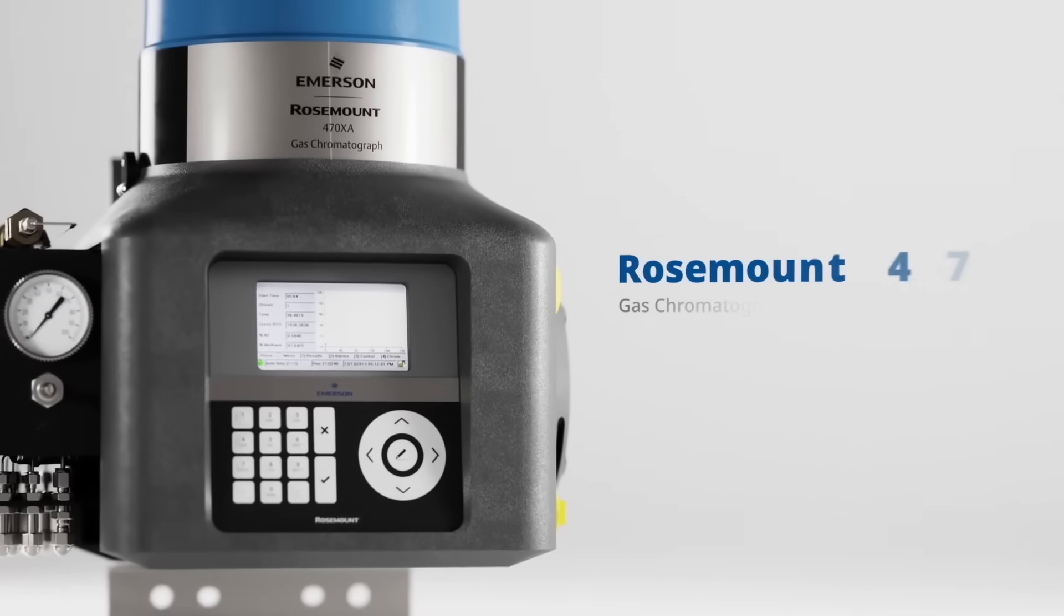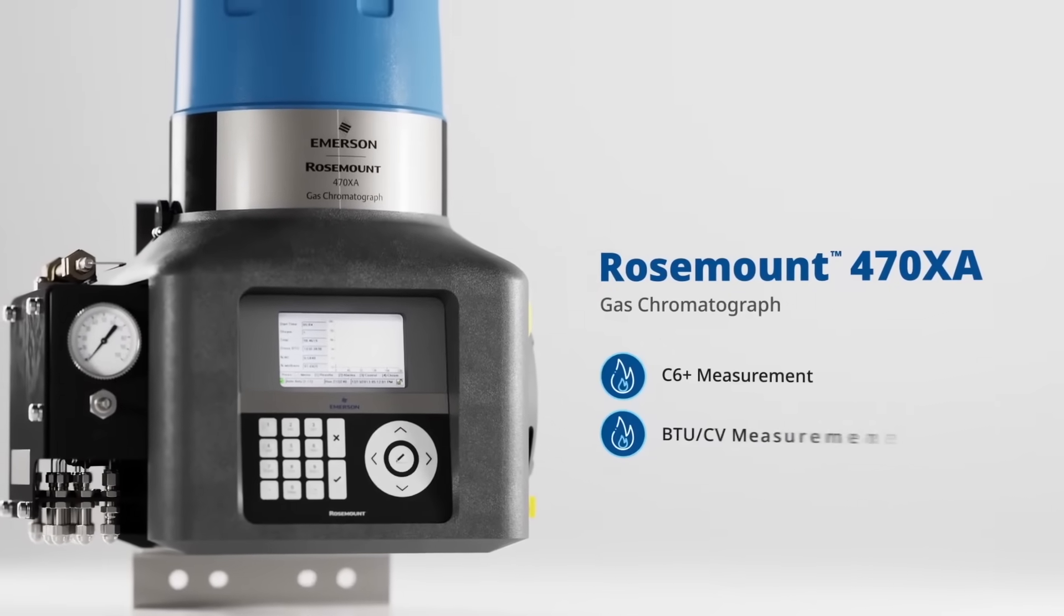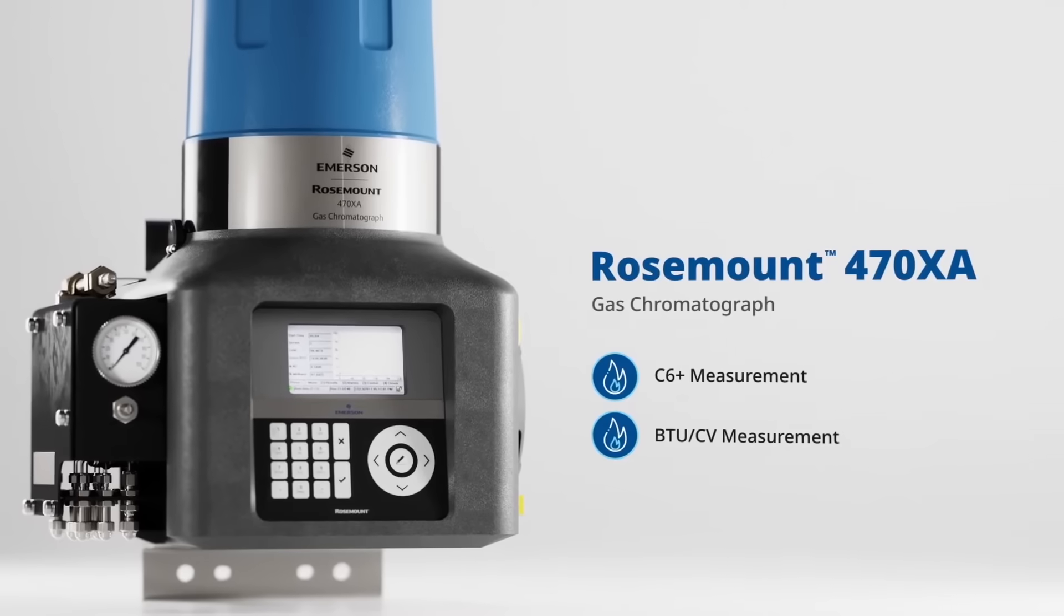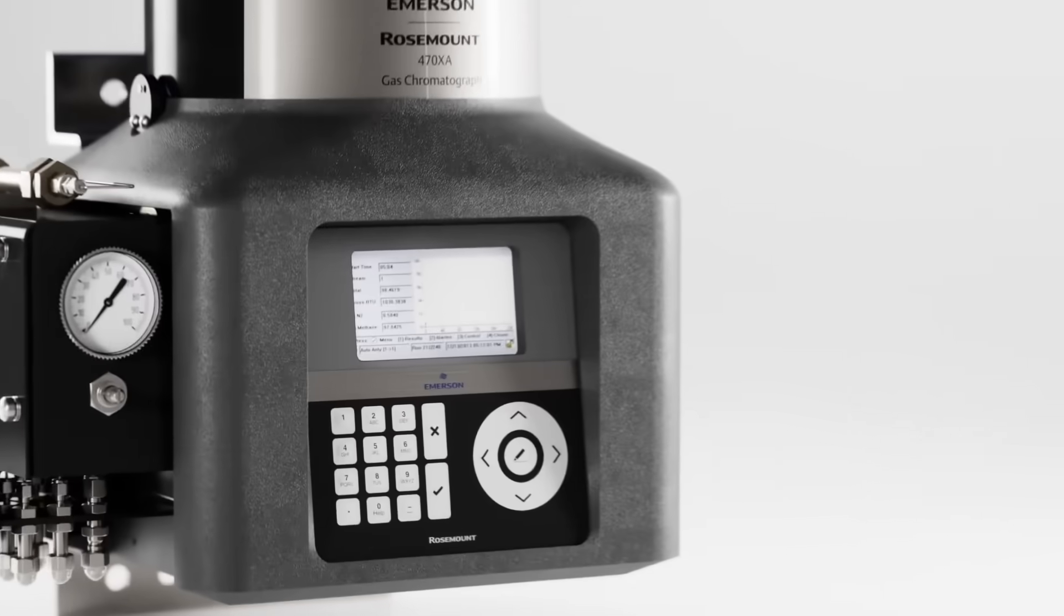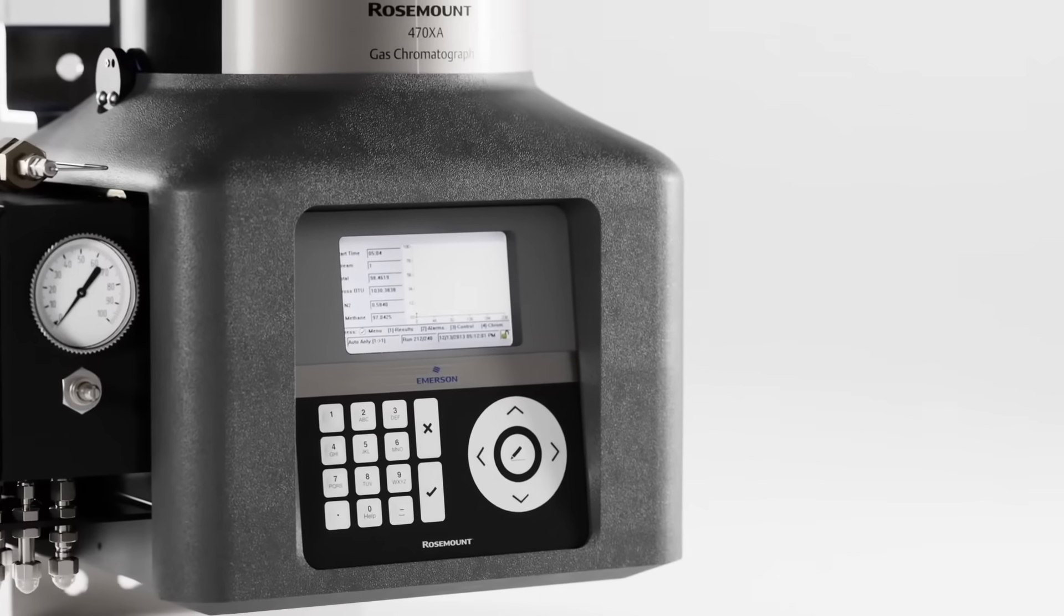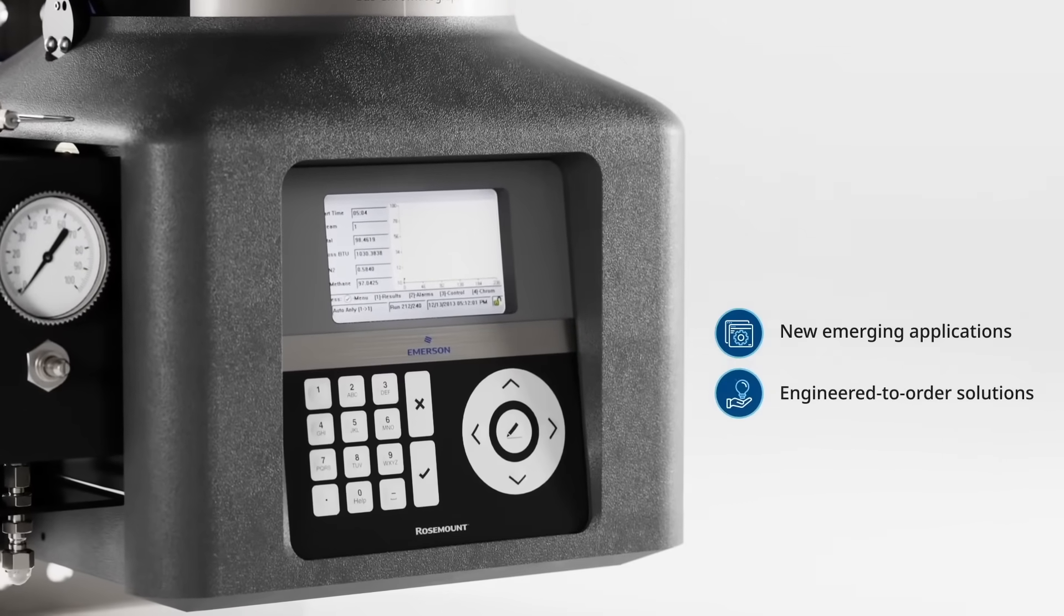Emerson's Rosemount 470 XA GC provides the standardized C6 Plus BTU-CV measurement, for which the Rosemount line of gas chromatographs have been historically known, while also providing the platform for expanding our base GC line to new emerging applications and engineered-to-order solutions.